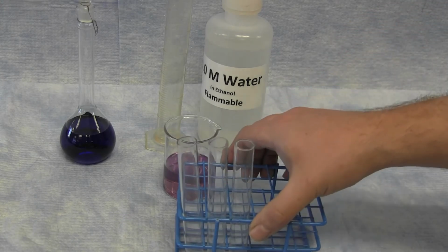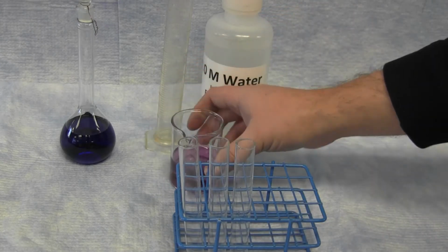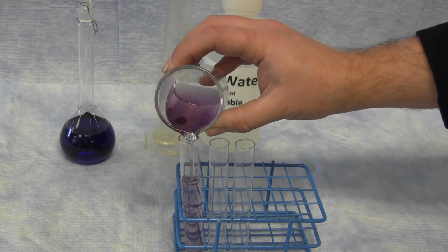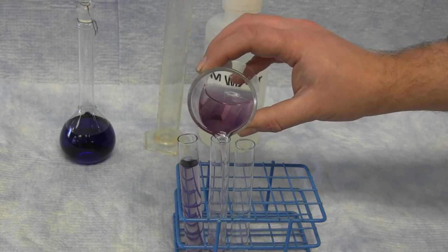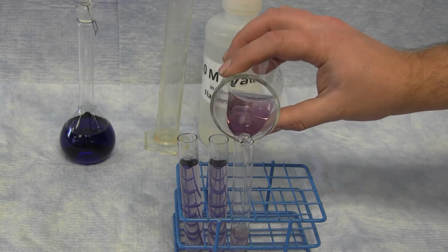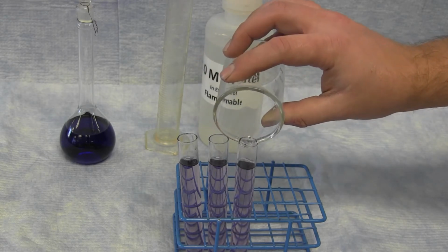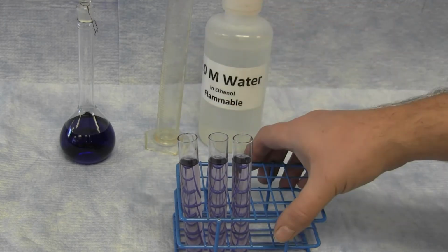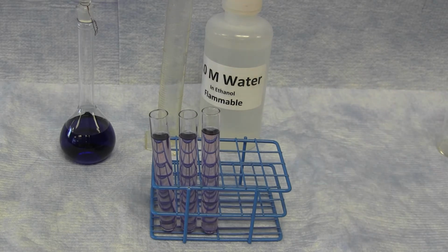When you have the solution prepared, you will then be placing some of that solution into 3 different test tubes. You're going to investigate how this equilibrium reaction works between these two complexes and how that relates to the temperature of the reaction.